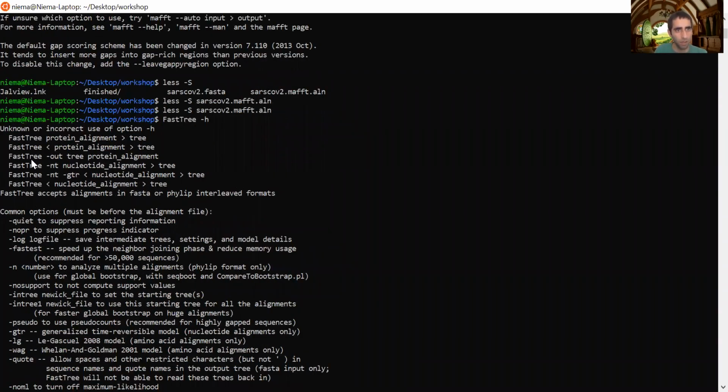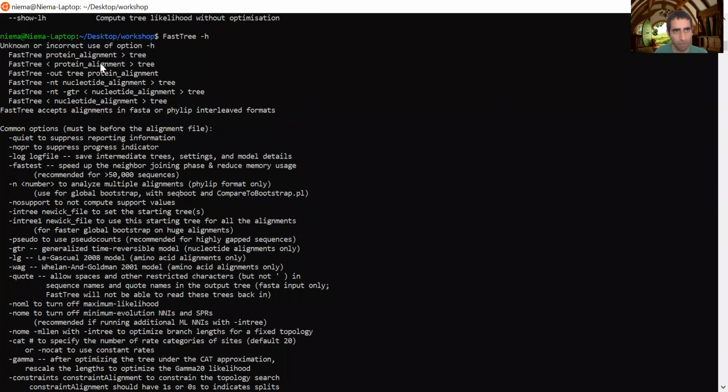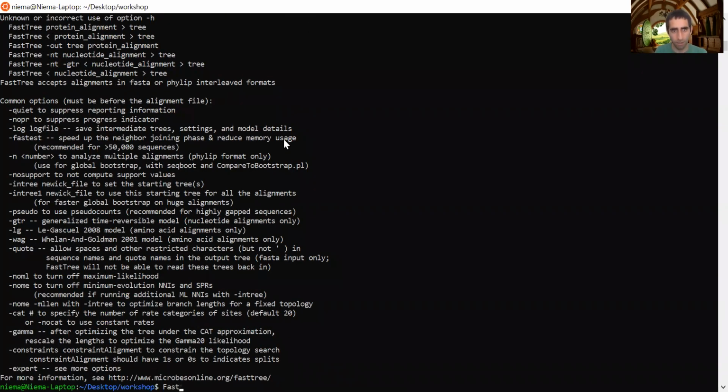So let me just call it with -h again, so now we get it down here. So FastTree takes as input, so I call FastTree.